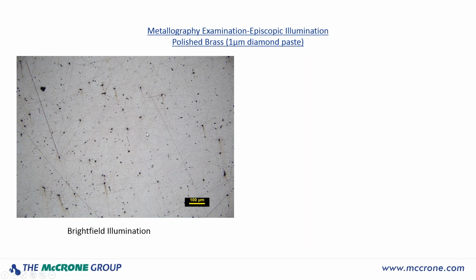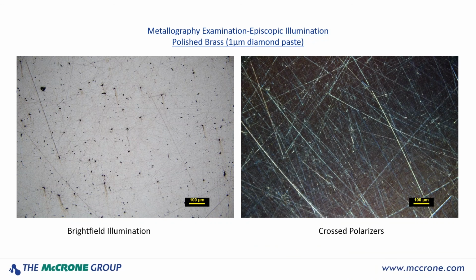So now let's go ahead and cross the polarizers. Well, there's our scratches again. And for the metallographers out there, if you're looking at how well you have done, you may not want to look at it with cross polarizers because it'll be a sticker shock for you compared to the bright field system, but it certainly can be used as a quality test for how well your polishing has been going.